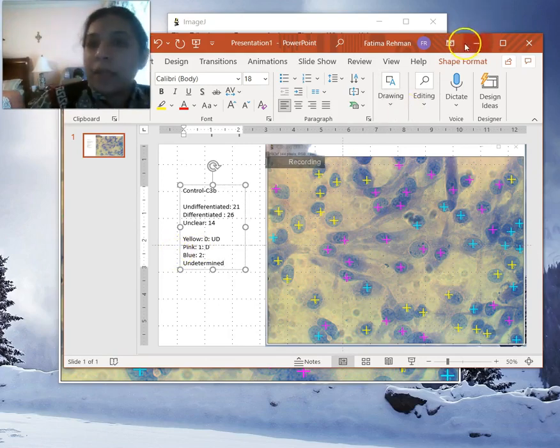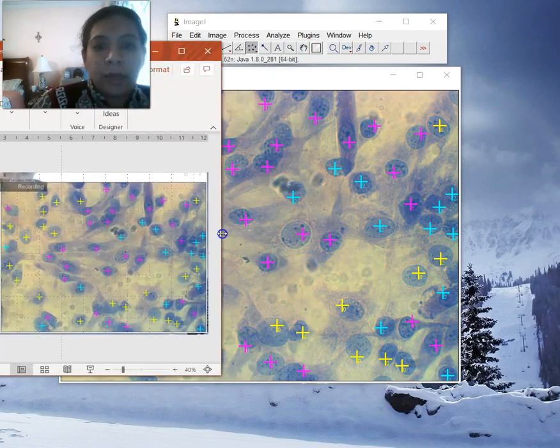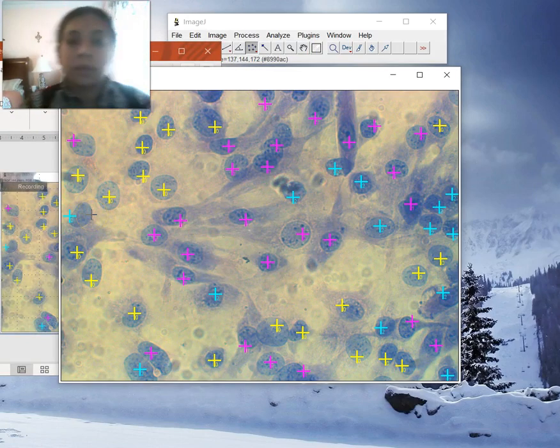Okay, so now you have record of all your cells and the way you had them. Now we get to the second part of this exercise, where we want to now also determine these cells that we weren't sure about. How would we do that?